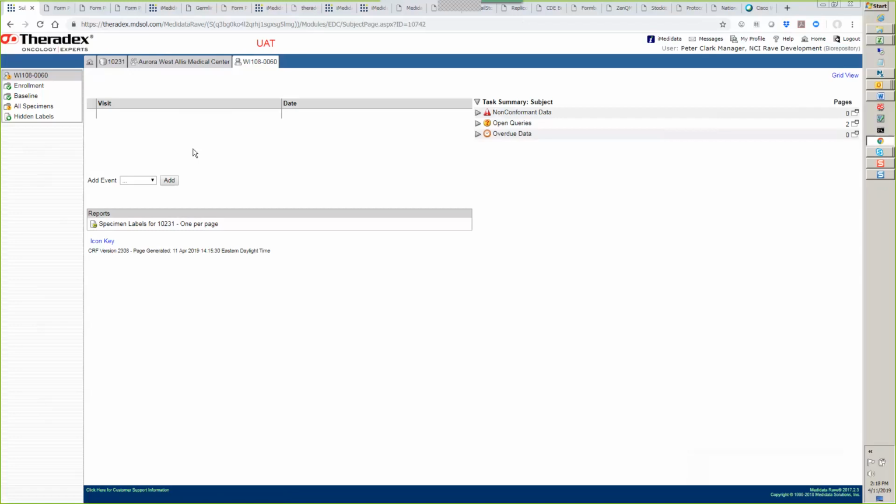Some PIs are particular about certain clinical data not being shared with the lab, but I can only assume that the PI has okayed your full access to that read-only all sites, because that role is one that we assign when the PI sends in a form listing study-wide access. Okay. I just wanted to throw that out there for future, for others.